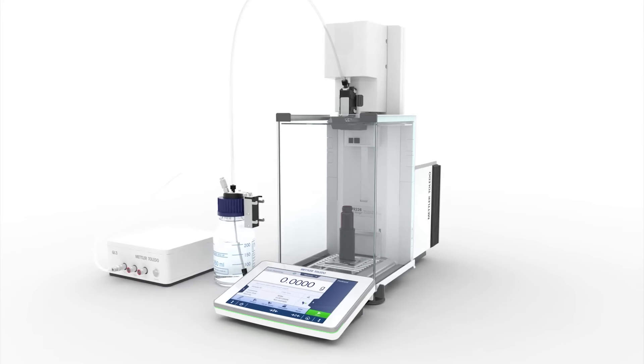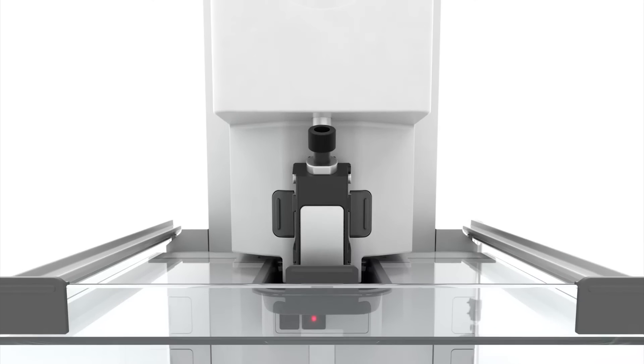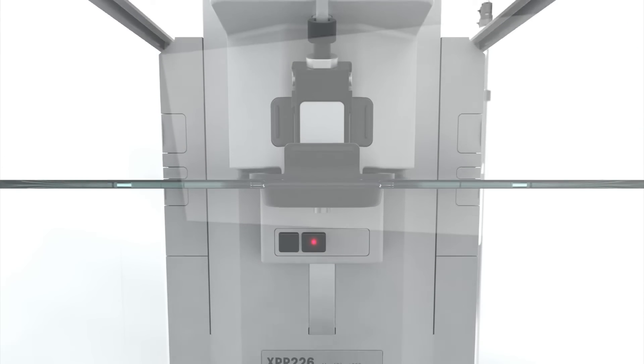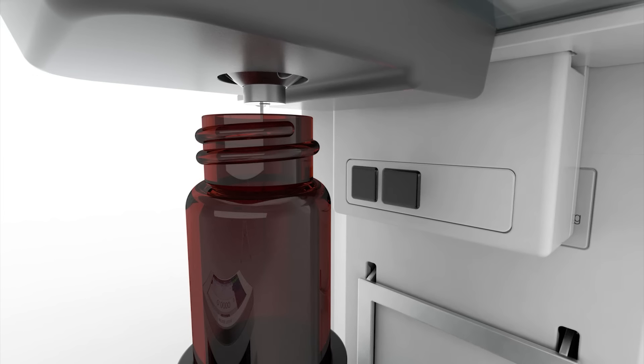Make the switch to an automated gravimetric method with the XPR Automatic Balance, which offers fast, efficient, and safe automated liquid dispensing.